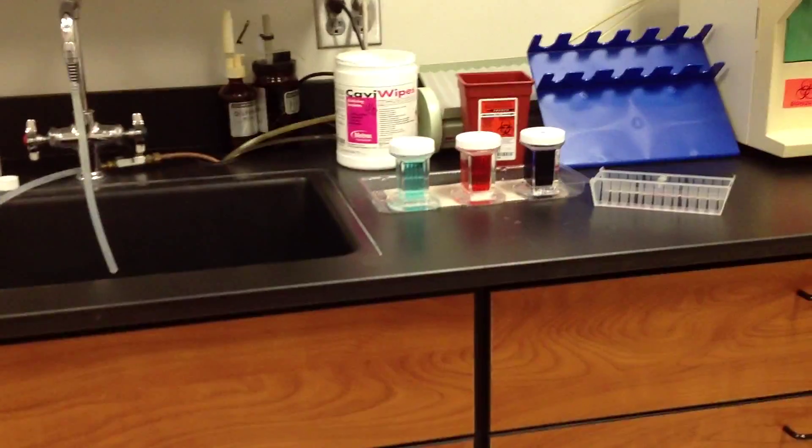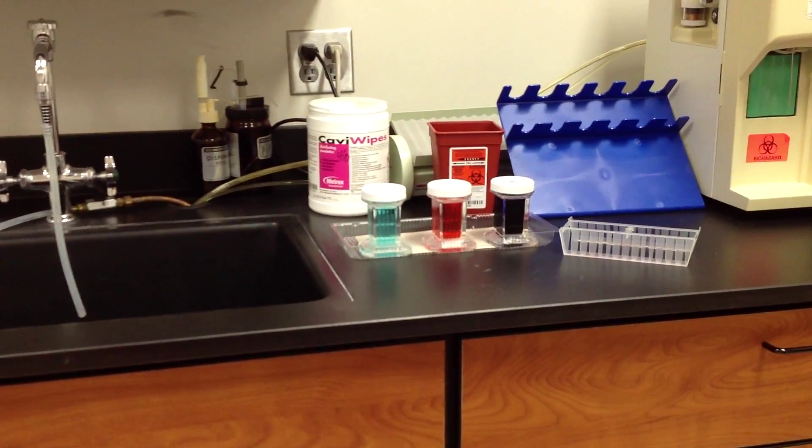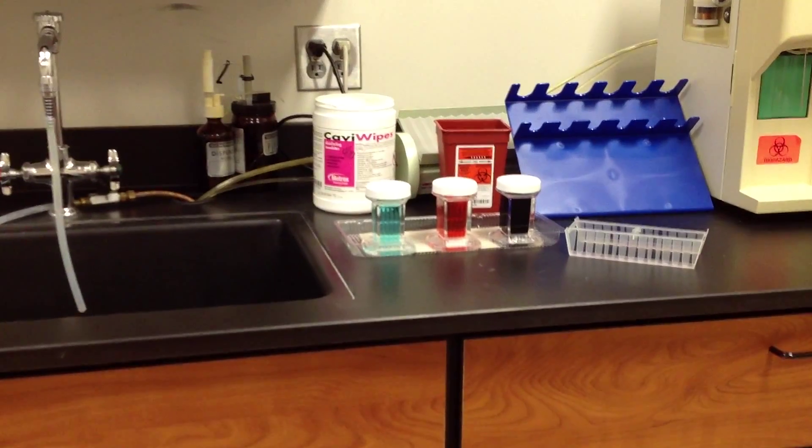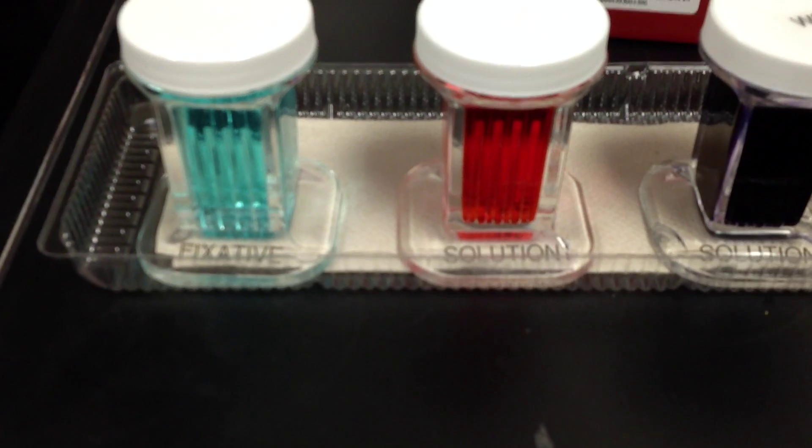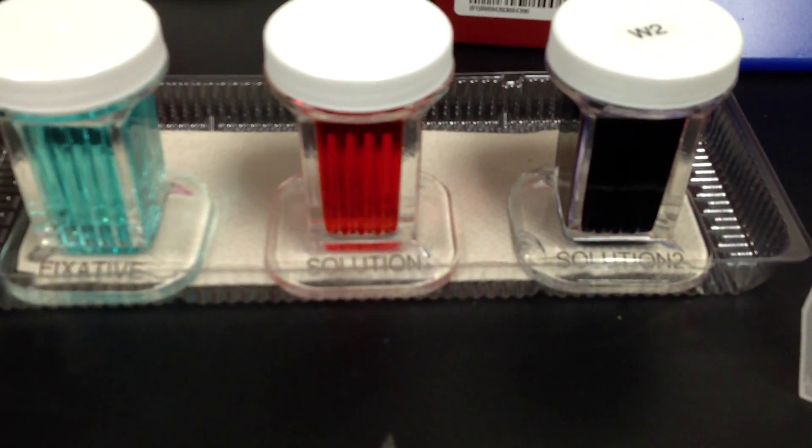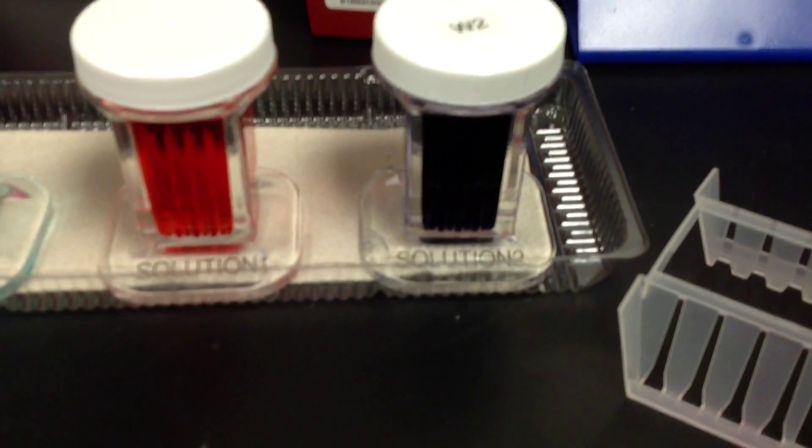We're going to perform a Wright stain on our dried peripheral smears. It consists of three solutions: a fixative, first stain, and second stain.